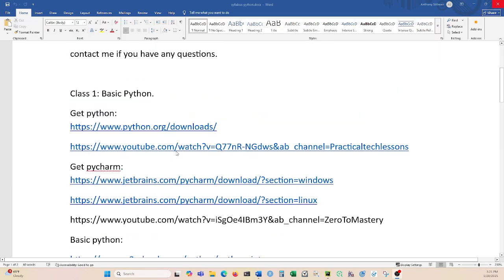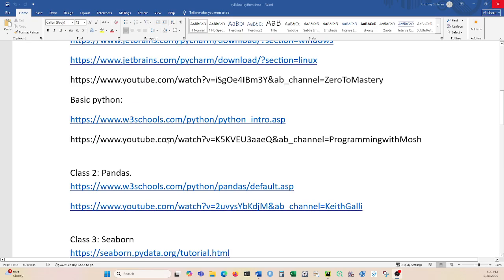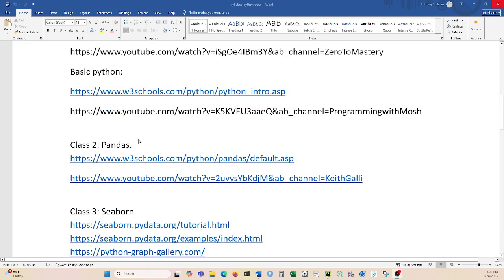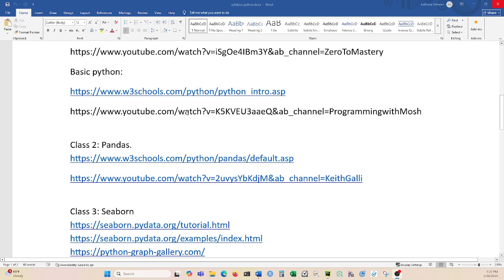You can see here that there are links underneath all these. They are either download links, which is these 3, or videos that are online that will explain things about these topics. Or there are W3Schools links or links to the documentation for the thing we are learning, like this one, and these can be read or watched to learn more.